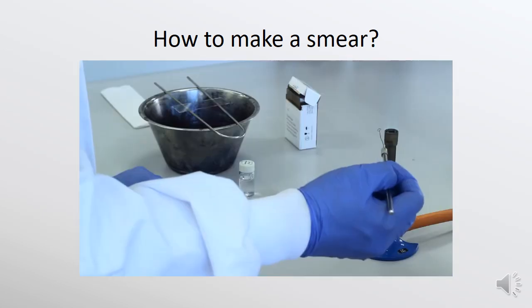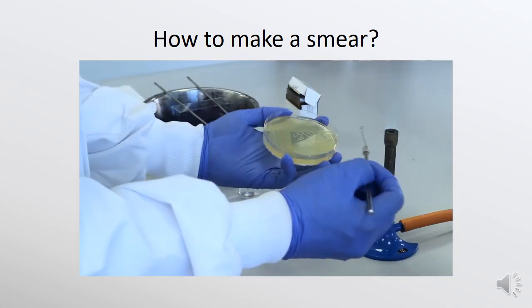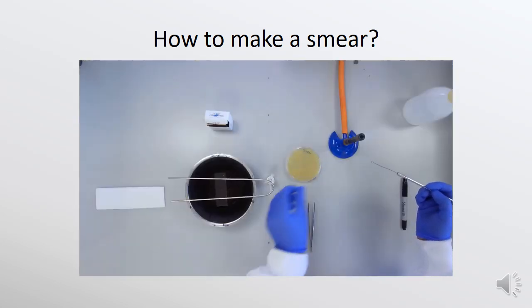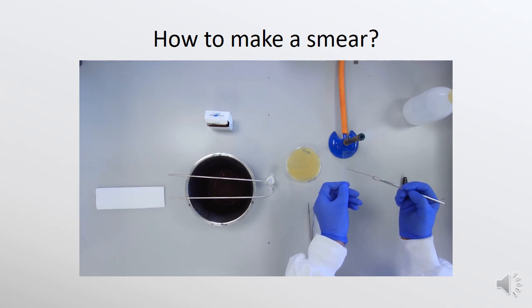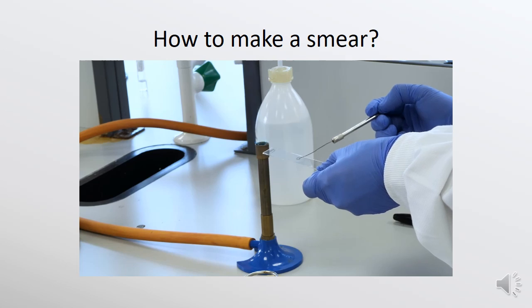Aseptically, take a small quantity of a colony from an agar plate on which the culture of interest is growing. Transfer this culture to the water drop on the slide and spread as shown here until the colony and water form an emulsion.